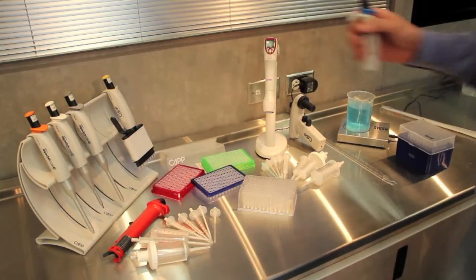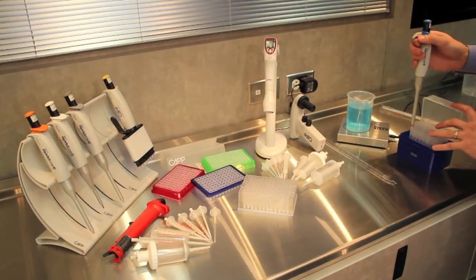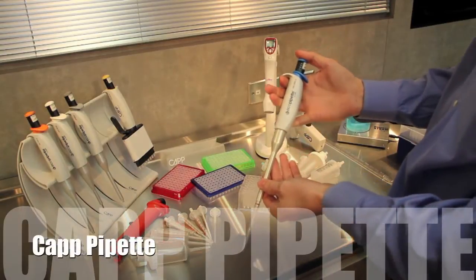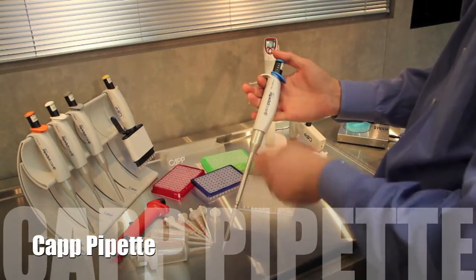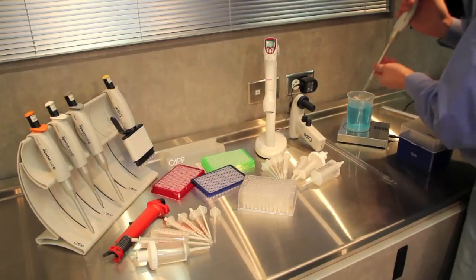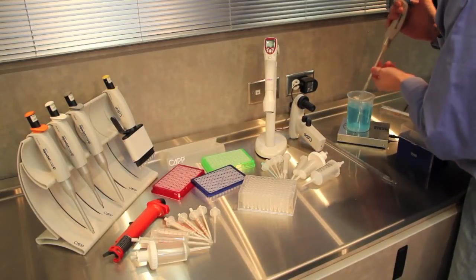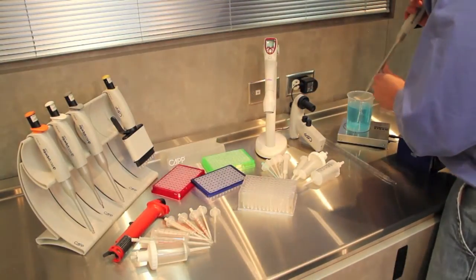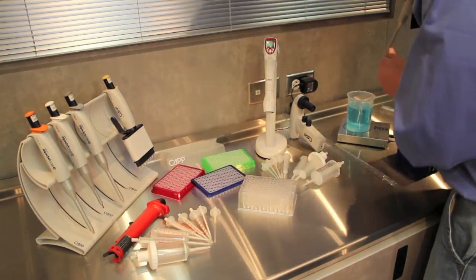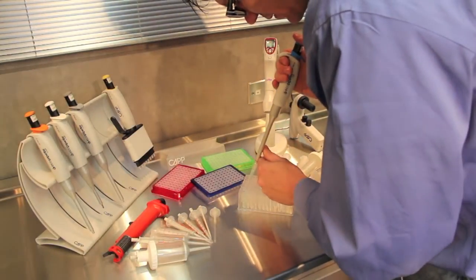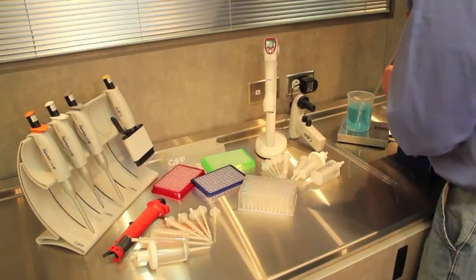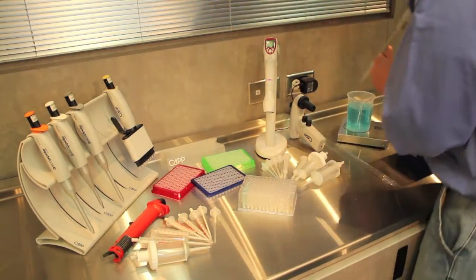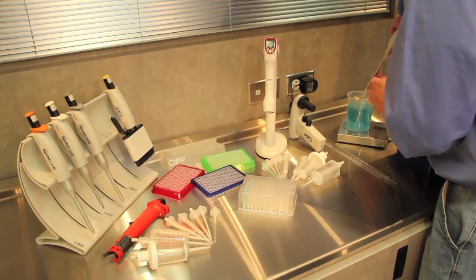The first one we're going to use is the standard 1ml pipette, this is our Cap Eco pipette. We're going to start by aspirating up the 1ml and dispensing it into each one of the reservoirs. Now, while the pipette is very accurate, it is not very fast at putting media into a plate, so we're going to look at a couple different options that will speed this process up.